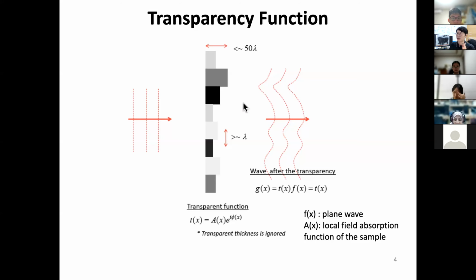However, now let's think of it in a more mathematical aspect. So what would the wavefront be like? When it passes through, you can see these parts will move forward, but these parts are thicker, which means usually a higher refractive index, so the wave will be retarded. It's a little retarded relative to the other. So you can see the wavefront can now be curved, not that much though. This is only an approximation.